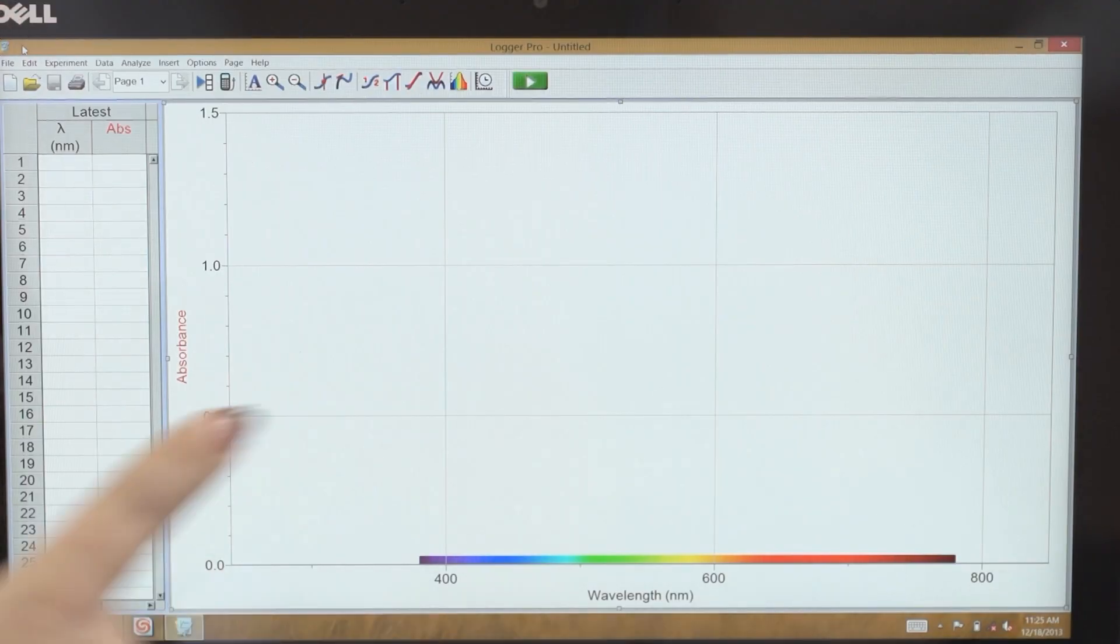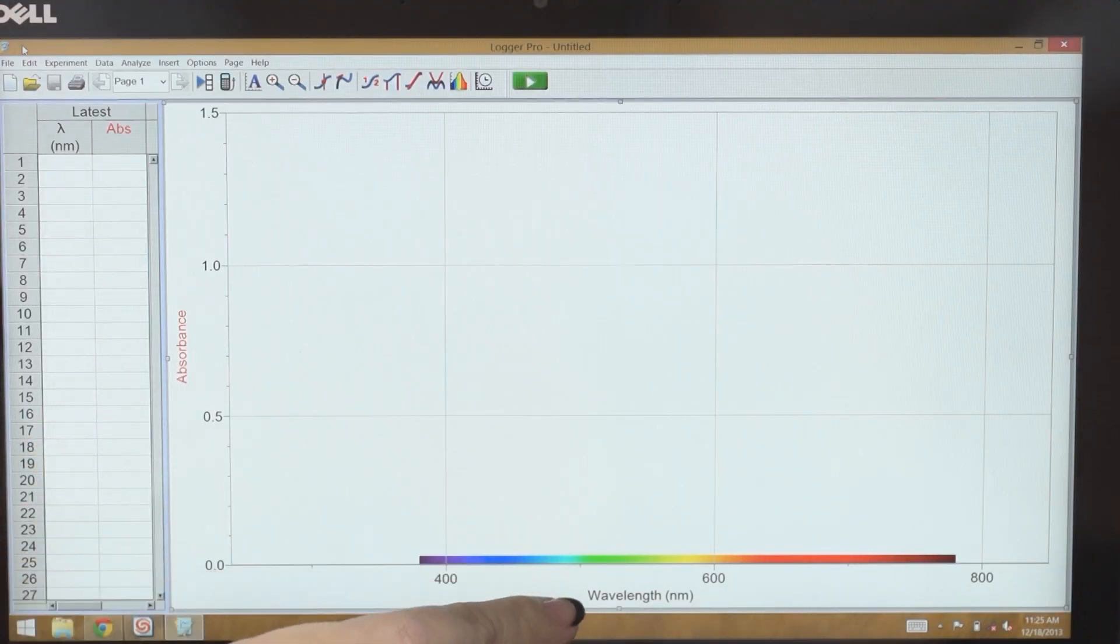So to begin, there are three different modes for the UV-Vis spectrometer. First is absorbance, and that's what's on by default. So when I open Logger Pro, I should see a graph of absorbance versus wavelength. I can also put it in percent transmission mode or intensity mode for measuring emissions.